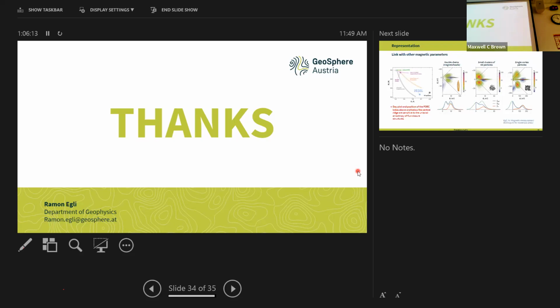So on that, there's no reversible ridge though. Is the reversible magnetization included in that integral? Yes, of course, because these are regular quantiles and there are reversible contributions inside as well. Not the reversible ridge defined by the pi; this was an extra thing that was added. This one not. But the regular reversible processes that you capture with the standard protocol are included. Yes. So the FORC magnetization is not a permanent magnetization, to be precise.